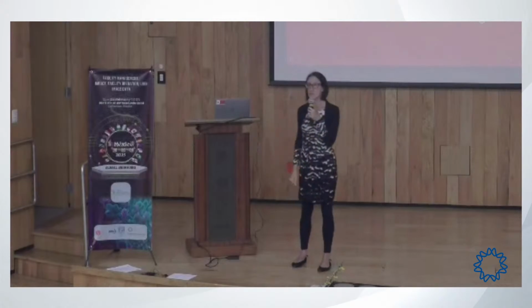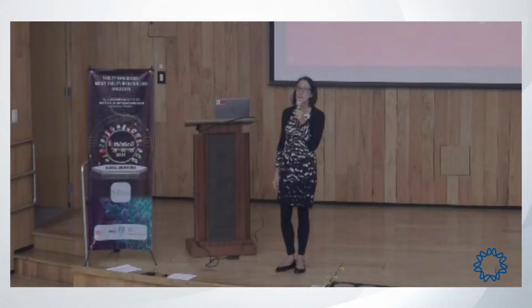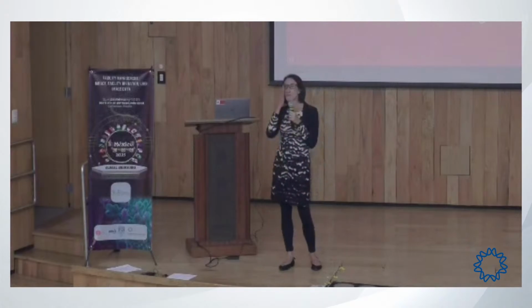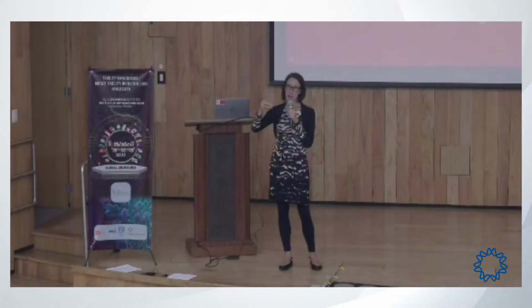Another question: you said that for small proteins it is difficult. Is there some possibility to get that kind of resolution for small proteins, like single molecule analysis? Totally. For example, I have some customers working with very small proteins, like 70 kilodalton, 60 kilodalton, or even less. The first thing I recommend is trying to find nanobodies or antibodies like Fabs, which can bind specific epitopes.